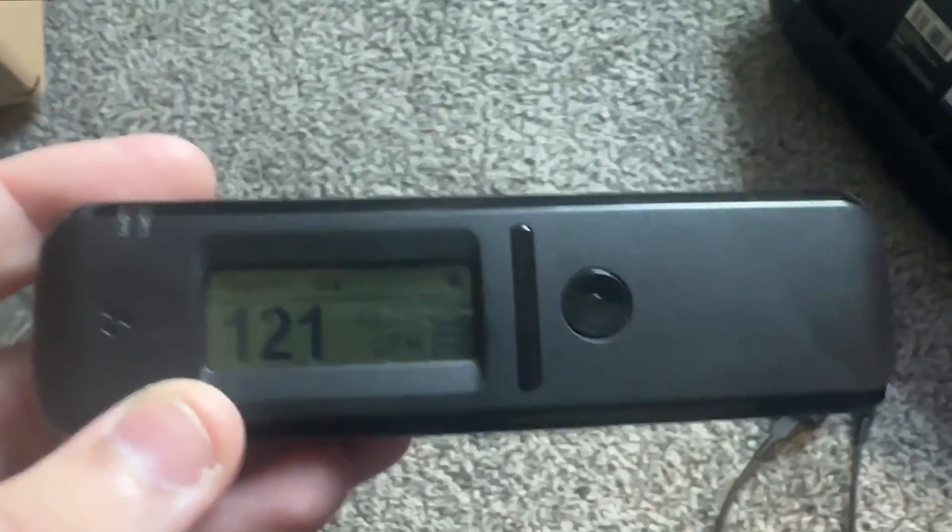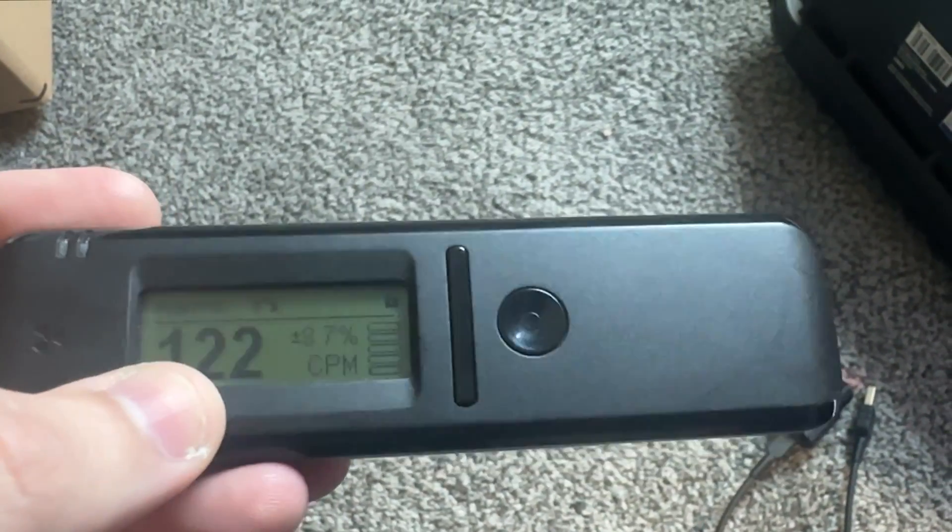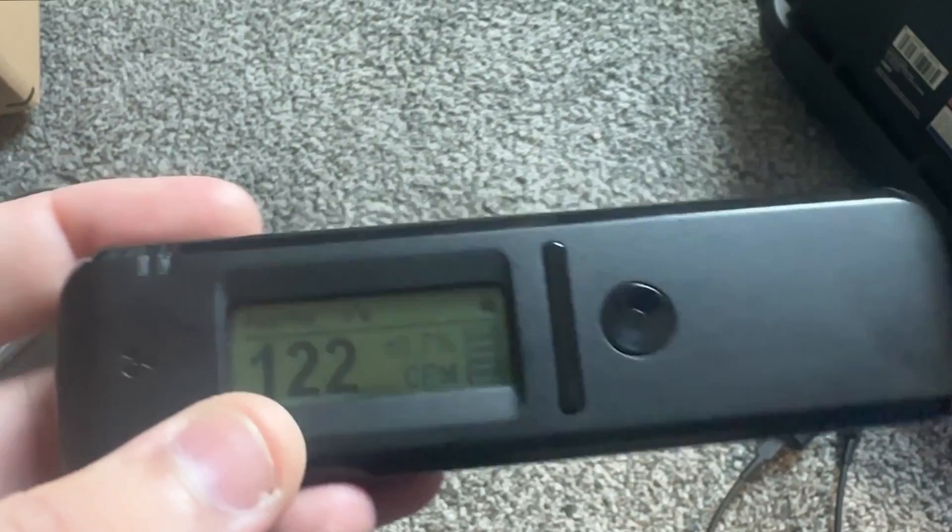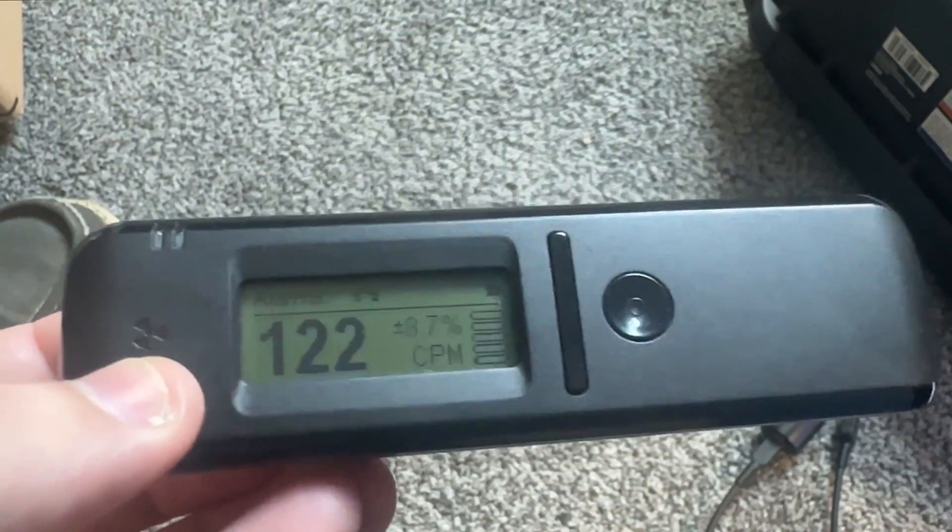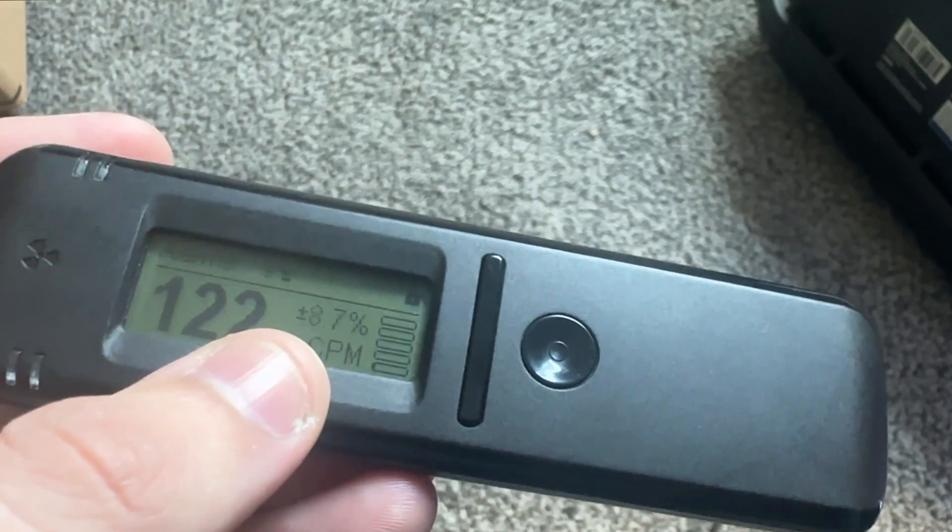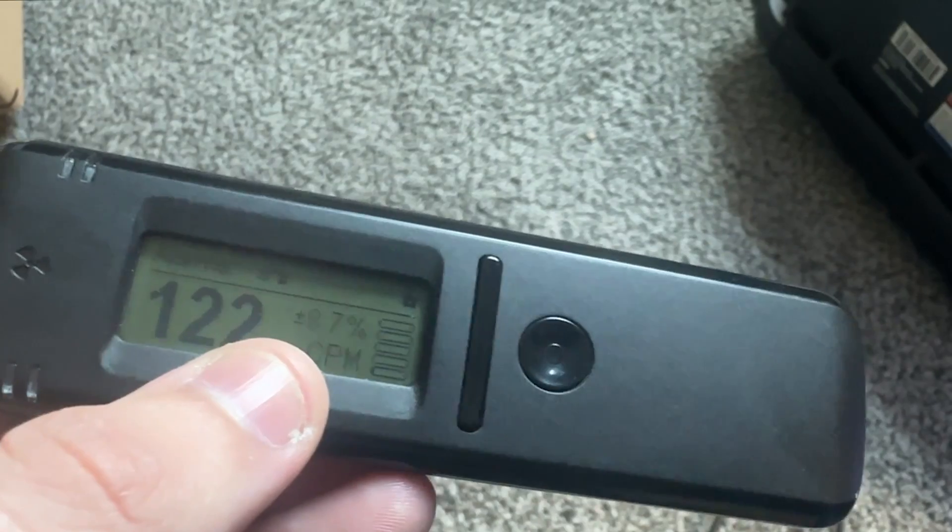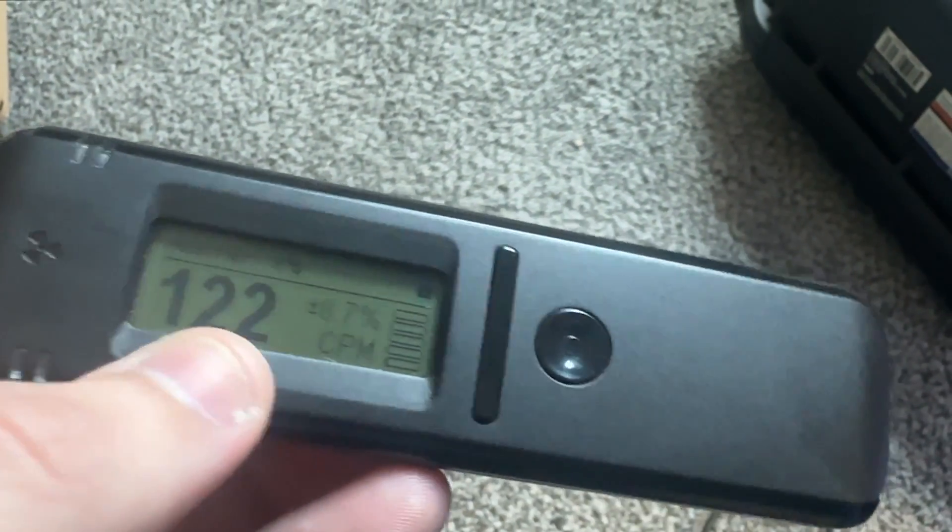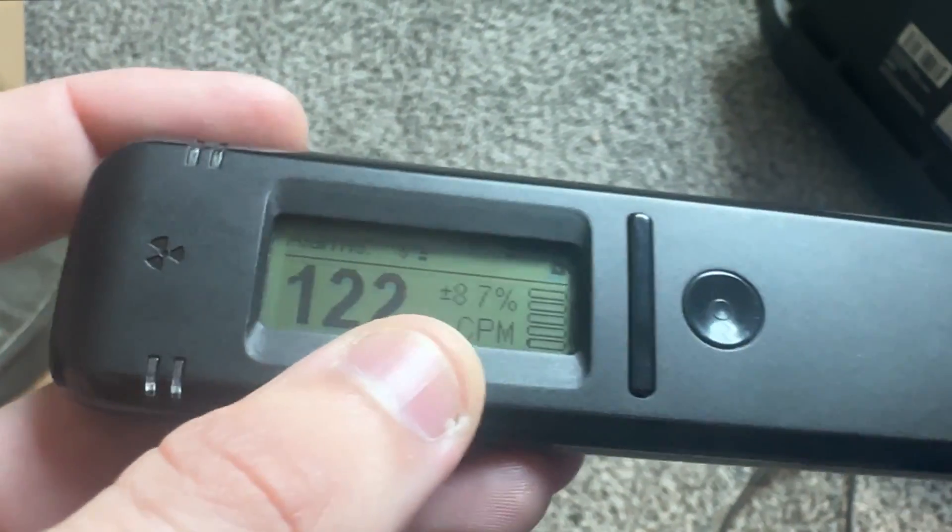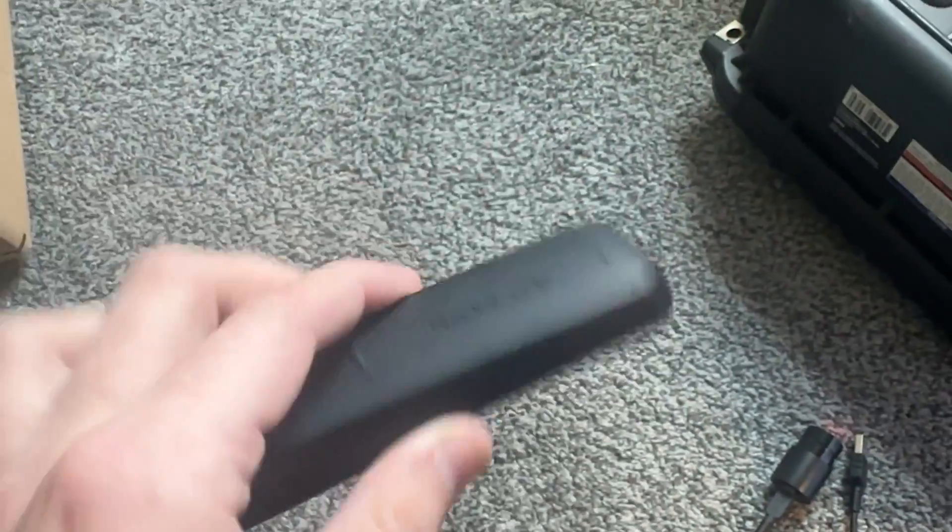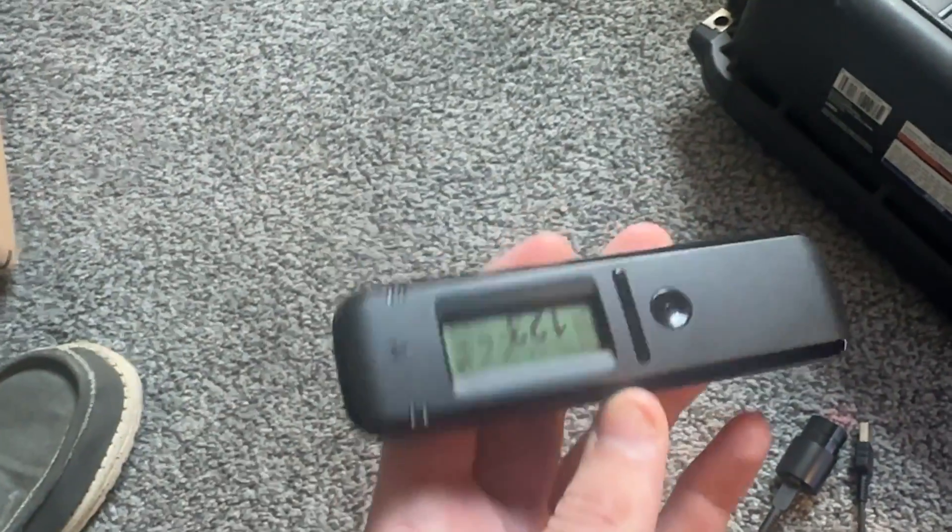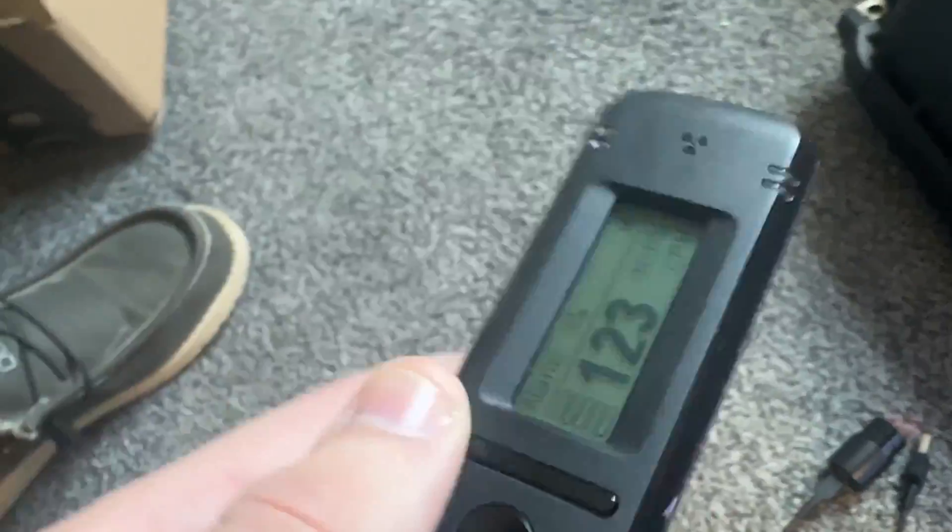Okay so here's the Radiocode itself. You can see right here is our counts per minute. We're reading back around about 122. Over here even gives a plus minus percentage of the accuracy of this number here which is 8.7% variation we could have in this. The size of it is first very small which is super convenient if you want to just put it in your pocket. This is what I've done.